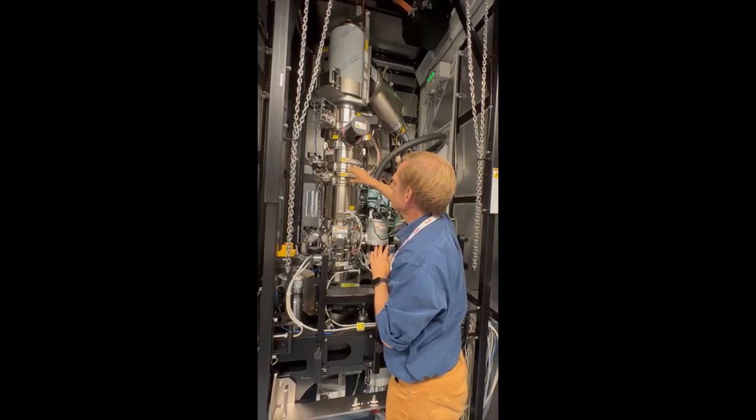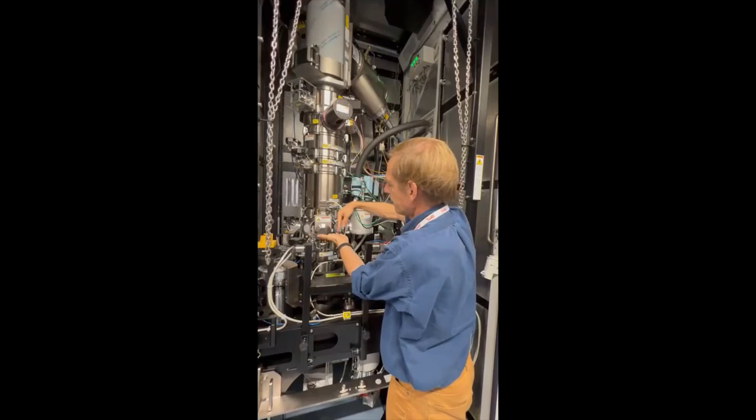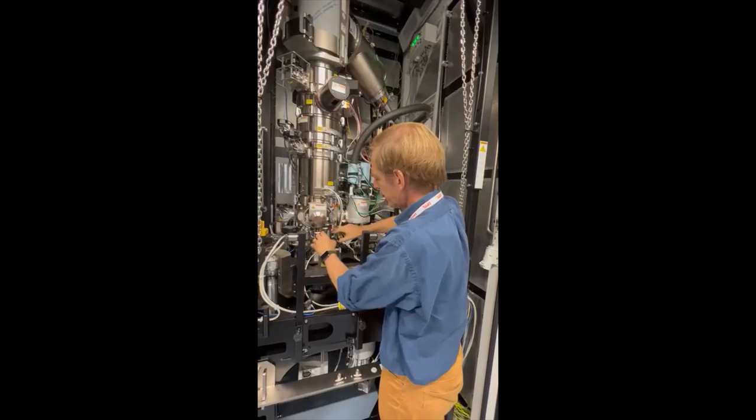We have magnetic fields that focus the electron beam. It's a microscope, so we focus the electron beam onto a sample that sits here into a small spot. The sample has to be thin enough, like a thin layer of ice, and then the electrons fly through.